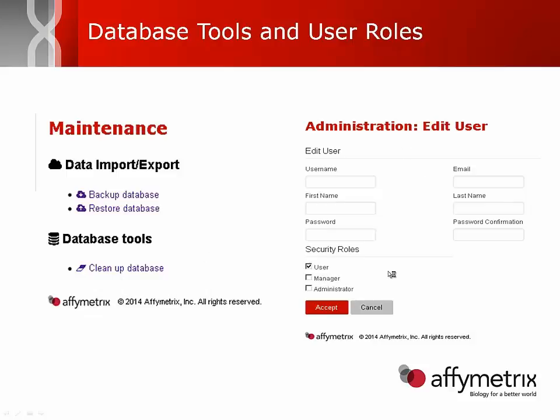If you have admin privileges, you can add users to your system. So you can give them a username, passwords, and assign their role. So again, users are going to be people that can query the database, they can do edits on an individual sample and calls, just like you could do in 2.0 and 2.1. But what they can't do is actually add data to the database or overwrite anything in the database. So you do have to be a manager in order to do that.